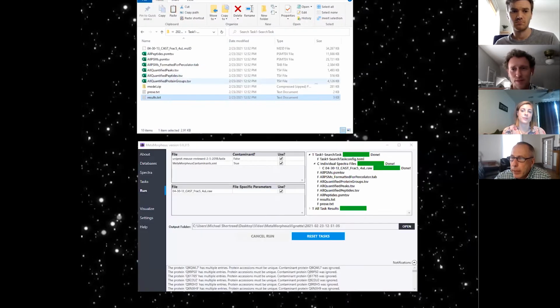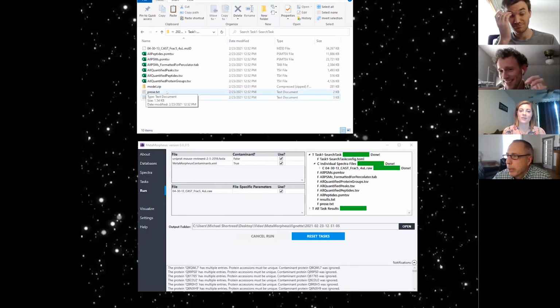Hey, Michael, yeah. Hold on. So you had a raw file. Did we use the raw file here? So we've loaded a raw file, 25,000 MS2s, 1 minute. What is your computer? Just give me some perspective here. Let me show you what the computer is here. That seems really fast to me, and I know it is fast.